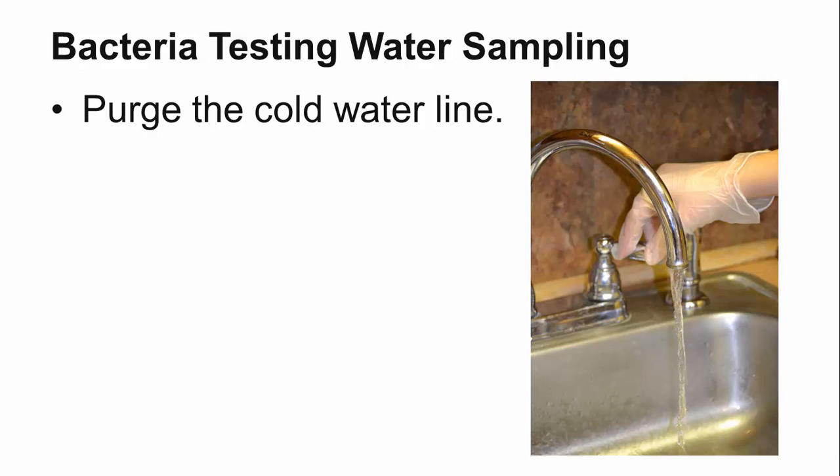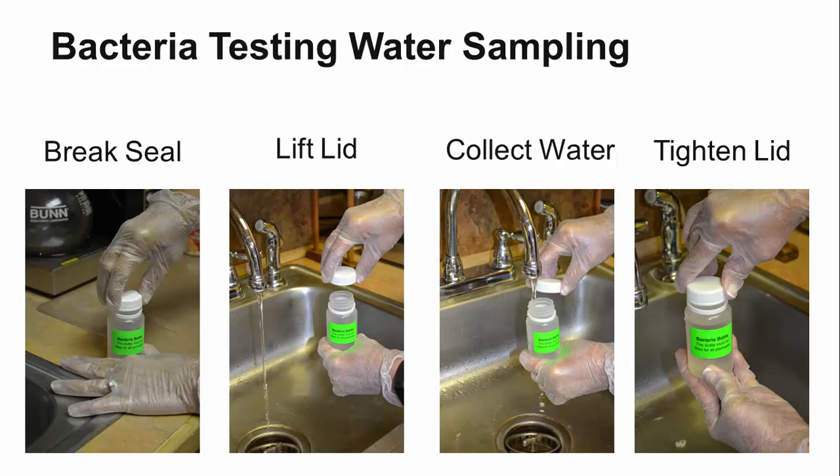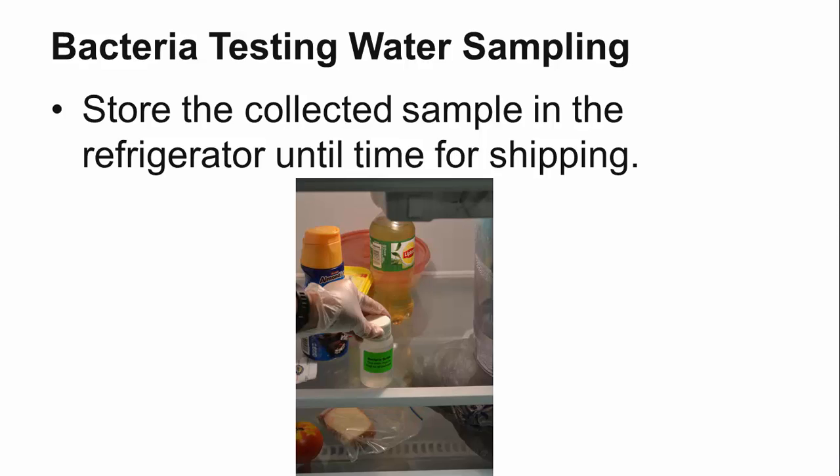Let's review. You start by purging the cold water line for about 5 minutes. It is best to wear gloves when taking a water sample for bacteria analysis. Carefully break the water seal on the bacteria bottle and separate the lid from the bottle by unscrewing and lifting the cap straight up. Be sure to hold the cap by the outside and keep your fingers away from the top of the bottle. Place the bottle under the faucet and fill to the 100 milliliter line. Be careful not to touch the top of the bottle with the tip of the faucet to avoid contamination. Do not overfill or over-run the bottle so you do not lose the preservative. Screw the lid back on tightly to prevent leakage. Refrigerate the sample until you are ready to send it to the lab. Remember that samples for bacteria analysis must reach the lab within 30 hours of collection to produce accurate results.